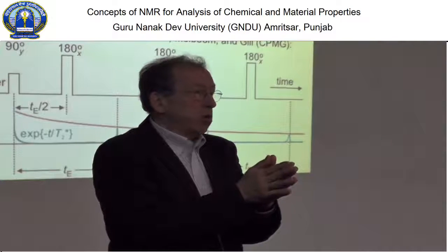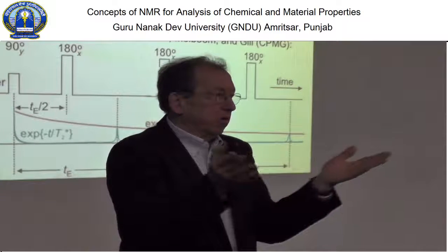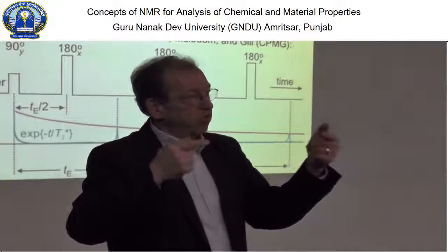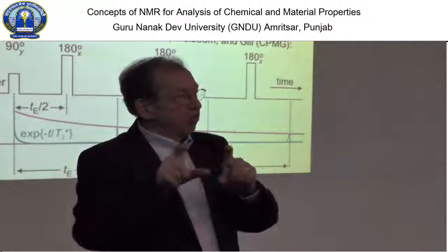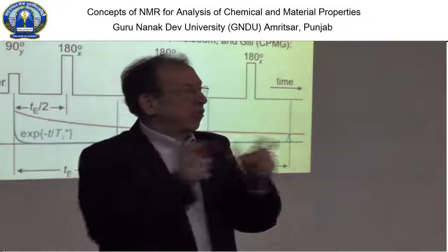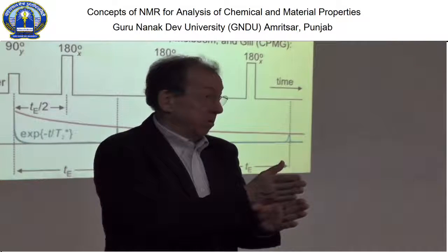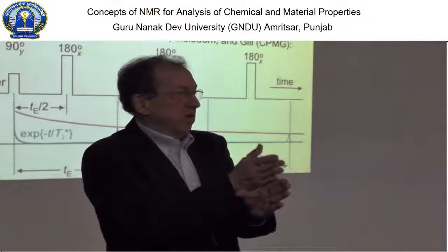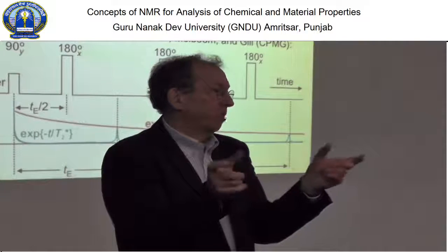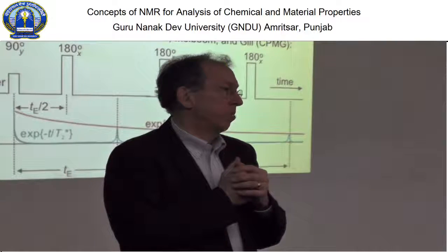So you actually multiply your NMR signal that is at frequency omega 0, the resonance frequency, with sine omega RF times t. And that gives you the sum and the difference frequencies. And depending on where you set the radio frequency, that tells you whether you have positive and negative frequencies in these sums and differences of your spectrum. It's just electronics. It's useful to do, but not necessary.